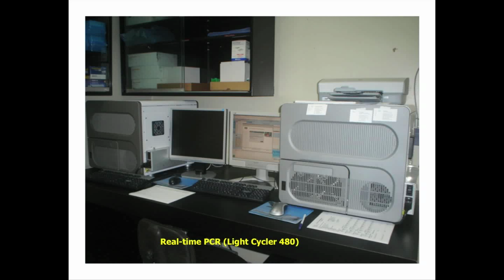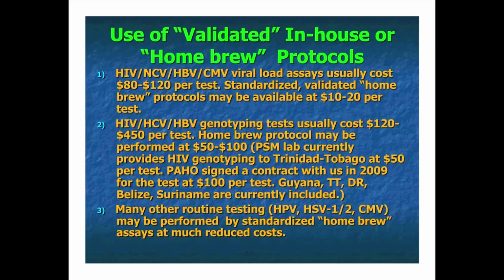So these are the LightCycler 480. Actually, this is aside, but since we put the sample in this way, we turn the cycler for our convenience.